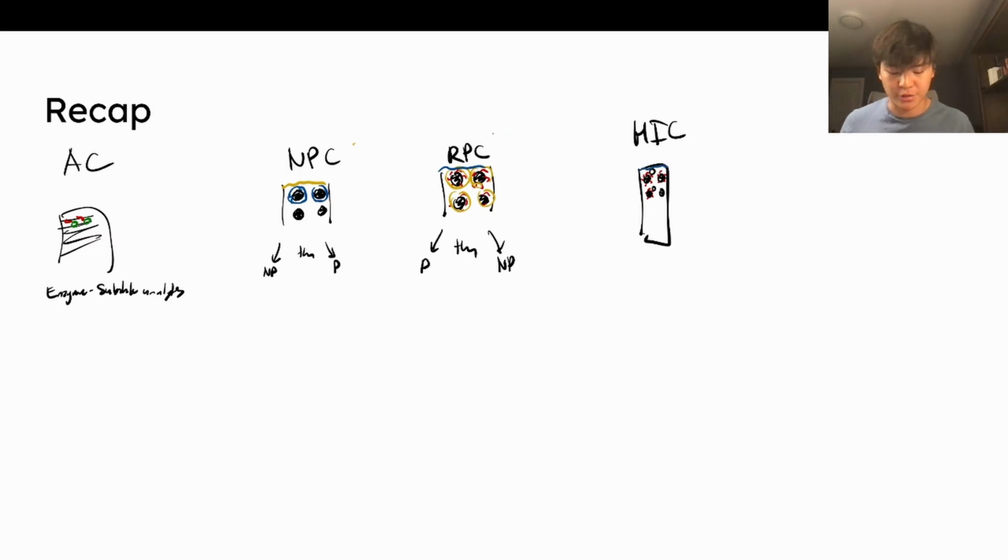What we do is we lower our salt concentration such that eventually the water will overpower these interactions. And so what we see leaves first is the most hydrophilic, then the most hydrophobic. Right, because the most hydrophobic remained on these beads longest.